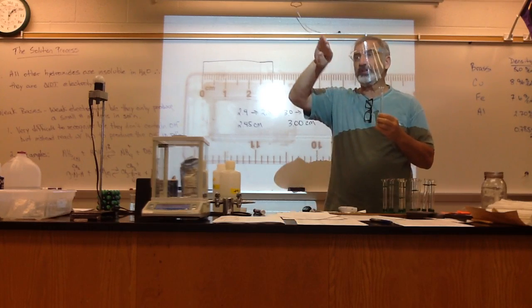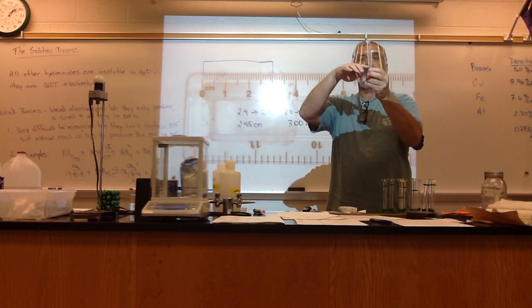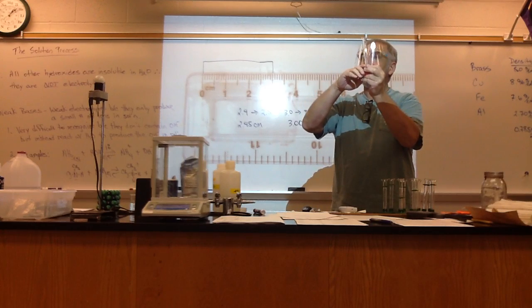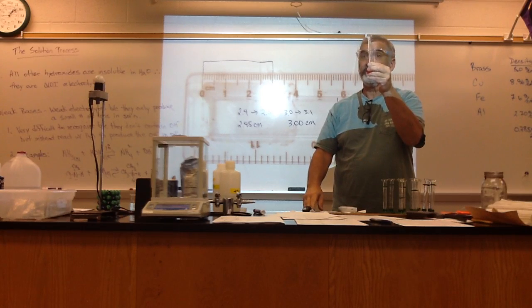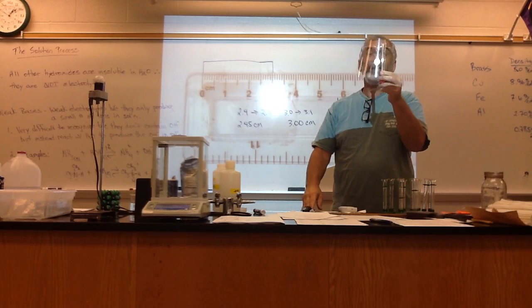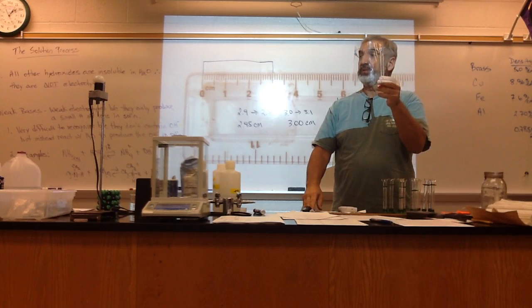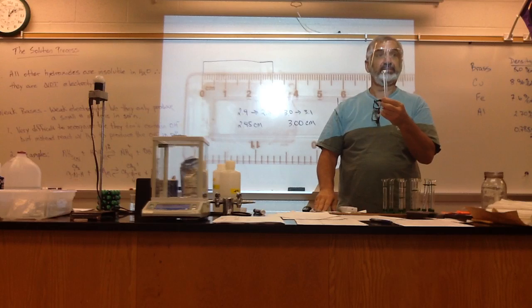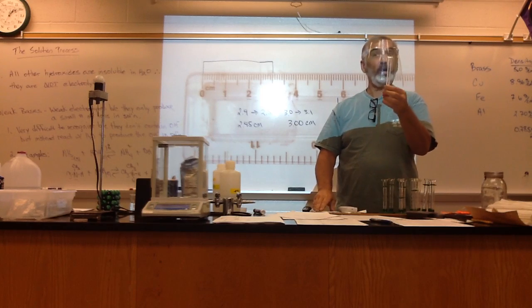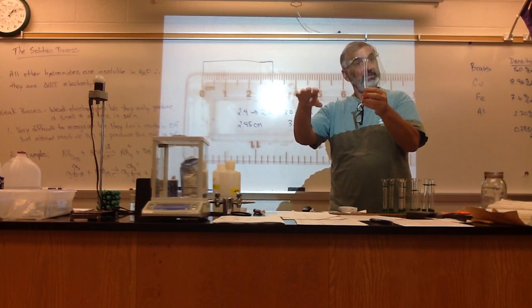And again, what do we call the curved line? And where do we measure from? The bottom of that meniscus. So get the bottom of the meniscus on the top of that line and you get exactly 3, then weigh it. Now how are you going to get the mass of the alcohol inside? You can't tare it, because that's going to zero. But why did we measure it dry? So you can subtract it, right? Because the alcohol plus the graduated cylinder minus the graduated cylinder is just going to be 3 milliliters.